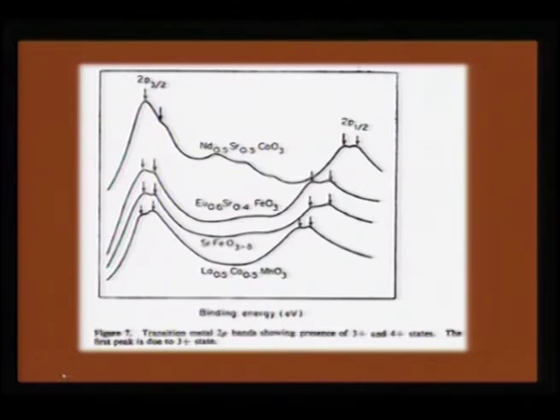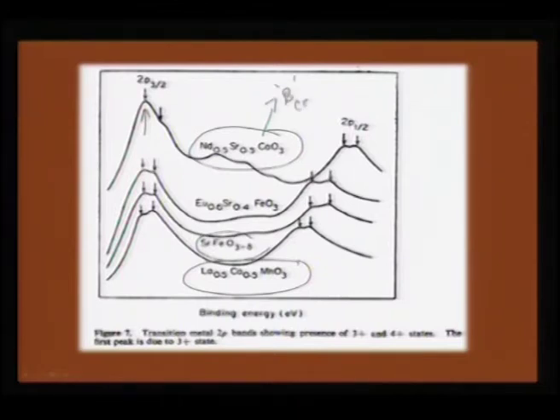The first peak that we see here in this case is actually coming from the +3 state, and then we also see a satellite feature. So, for all compounds whether it is ferrites or manganites or cobaltites, we can always look at the mixed valence states of the B cation, and therefore, this can become a very useful way to analyze it.